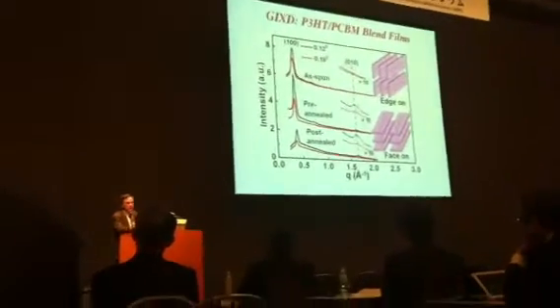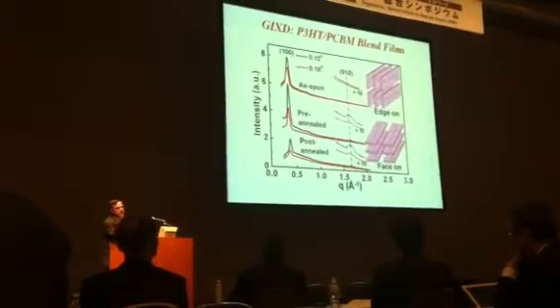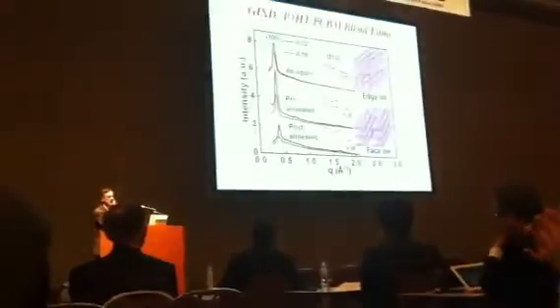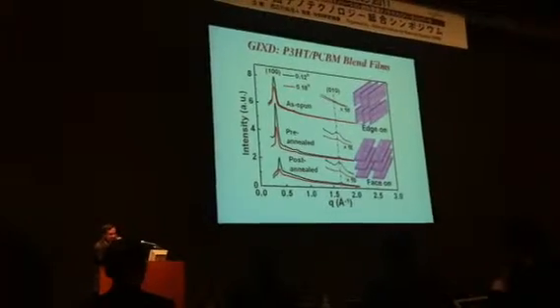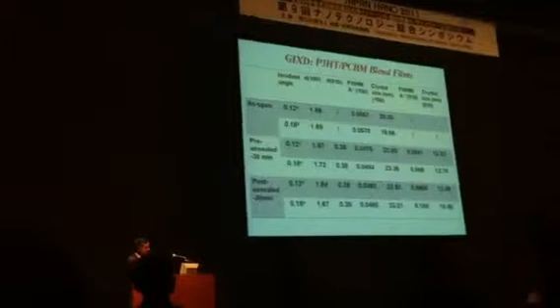So the simple measurement with grazing incidence X-ray scattering has told us that at the surface or at the interface of the electrode, whether you prepare the material with or without the electrode first, you have a very clear distinction or difference in the structures at that interface. And that actually is what's giving rise to the difference in the performance of these materials.